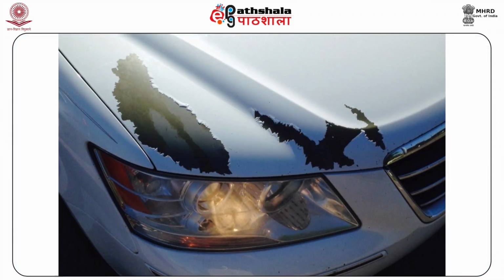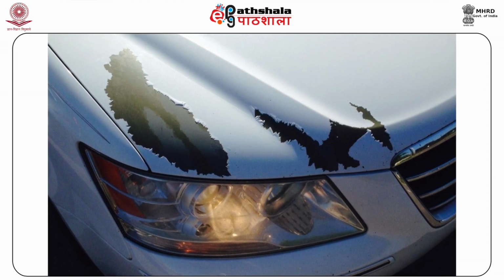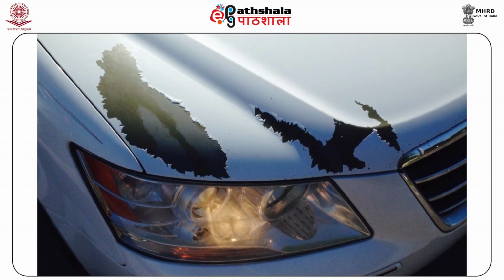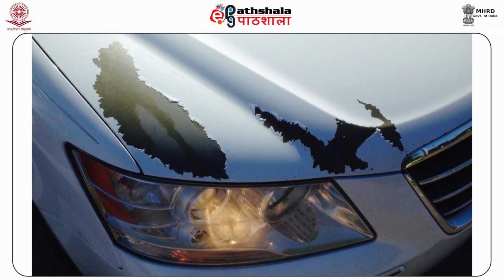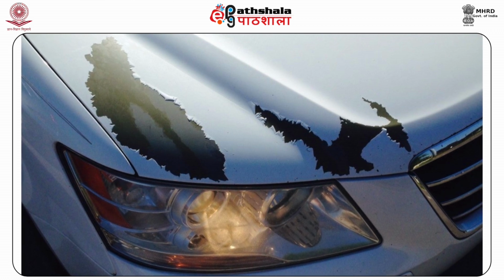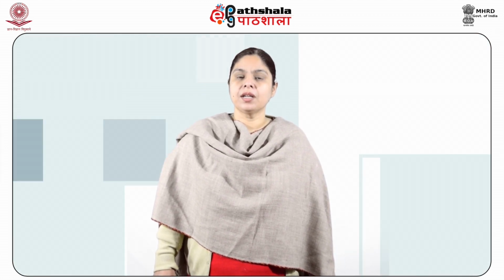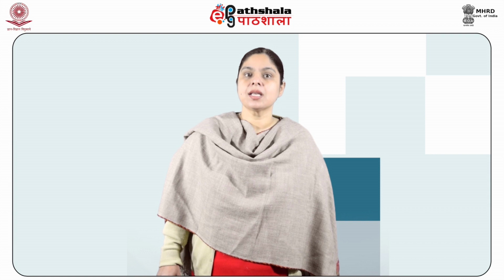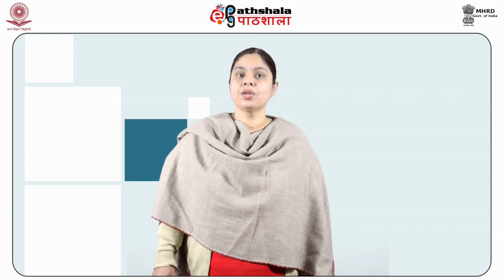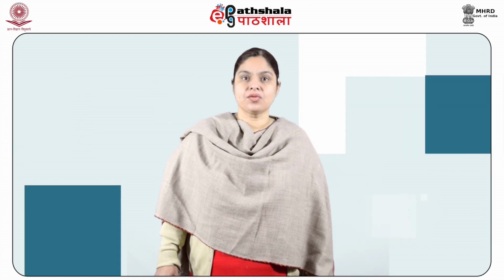Now, paint flakes can be removed by a number of methods, like lifting loosely attached flakes, cutting samples of the entire paint layer structure using a clean knife or a blade, dislodging by gently impacting the opposite side of the painted surface, etc. Once these formalities are complete, then for paint analysis, the sample size, the condition and the layer structure complexities are also taken into consideration while deciding which technique is to be adopted.